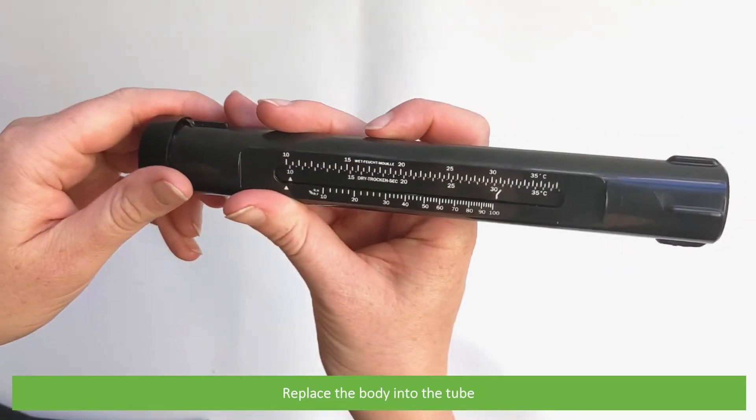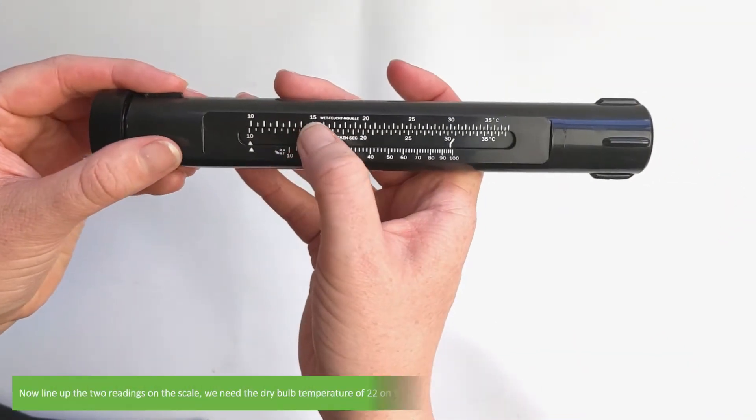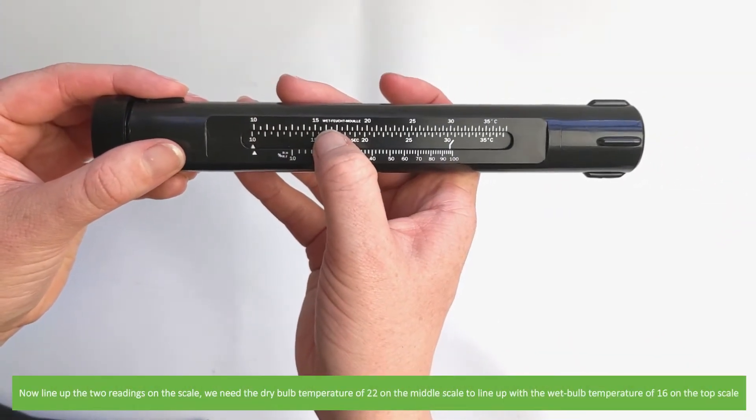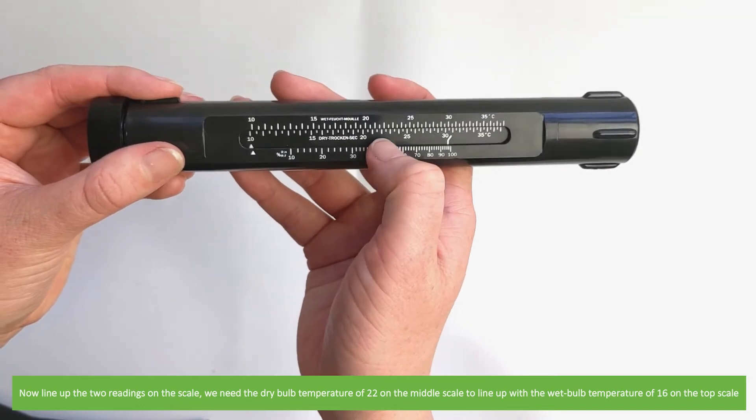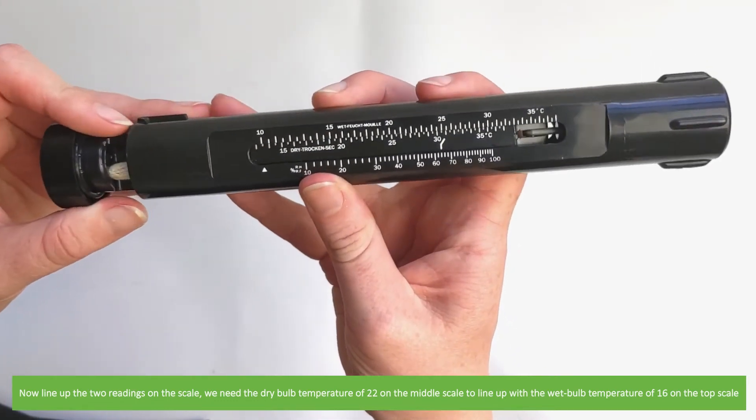Place the body into the tube. Now line up the two readings on the scale. We need the dry bulb temperature of 22 on the middle scale to line up with the wet bulb temperature of 16 on the top scale.